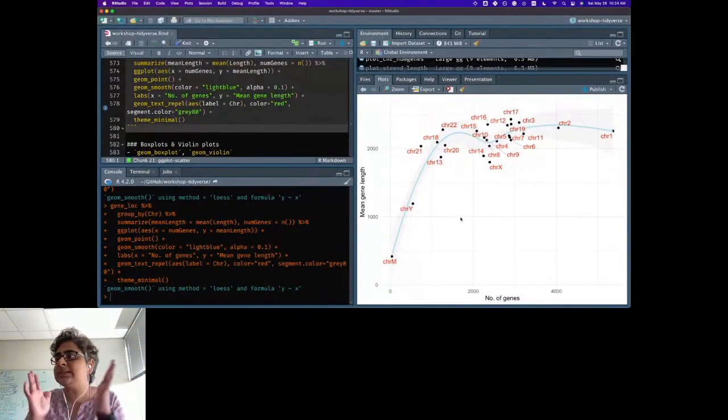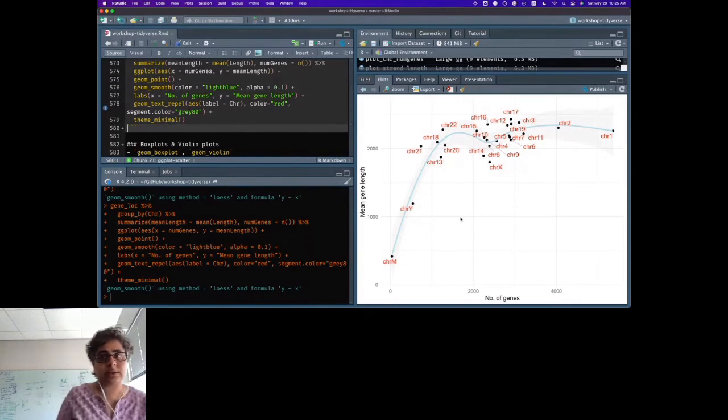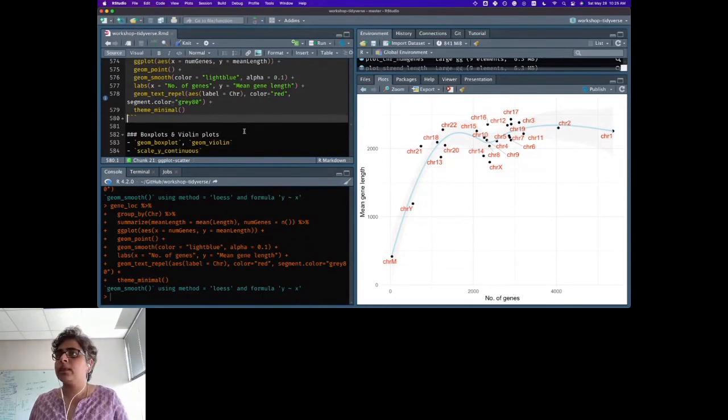You're just looking at, again, some simple statistics, but you're looking at it visually so you can make sense of it. So some people can just look at tables and tables and tables all day long and make sense of it. But for others, seeing them visually helps make a lot more sense and interpret the data much better. Also to figure out what other analysis you have to or need not do based on how the data looks like. So visualizations are extremely powerful that way. All right.